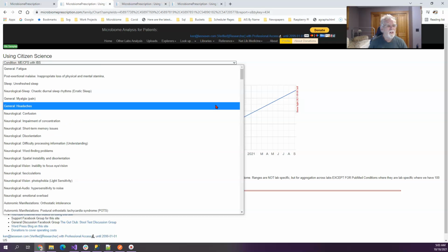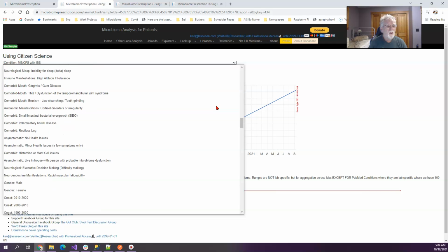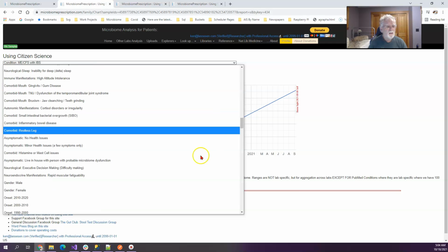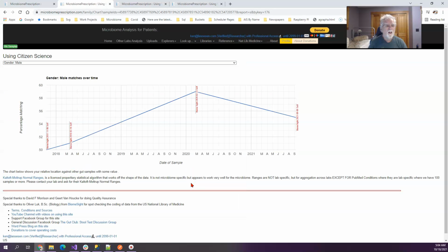And somewhere in here we have tons and tons of things. Let's check mail just for the fun of it. Okay, and so we have a 50%. Some of the relationships are strong, some of them are not. Take it with a grain of salt. Frequently the data is sparse.